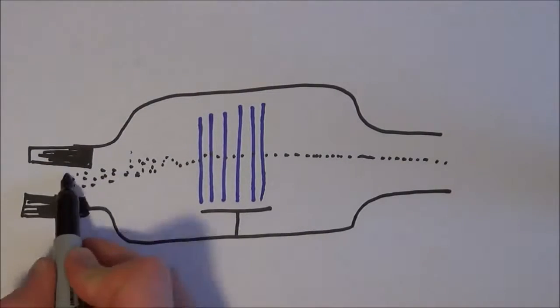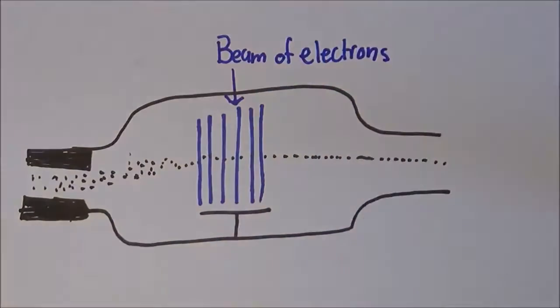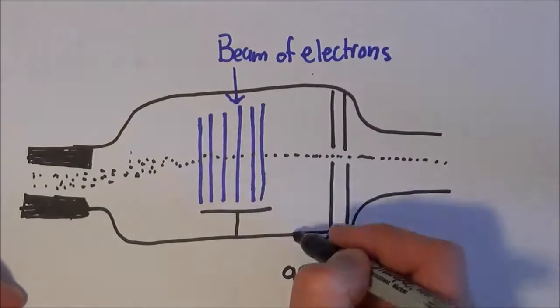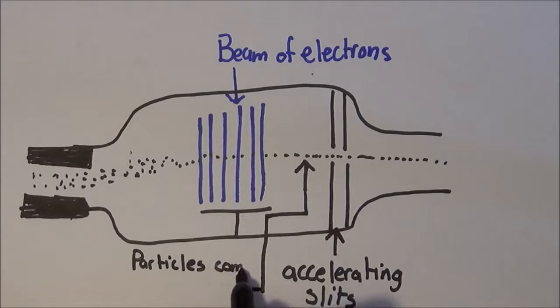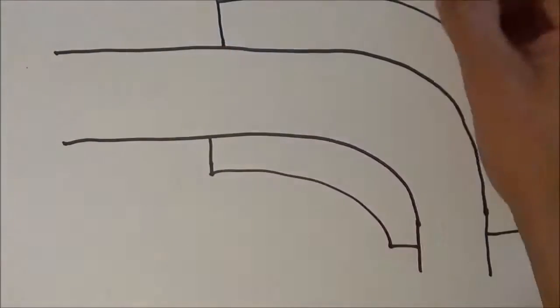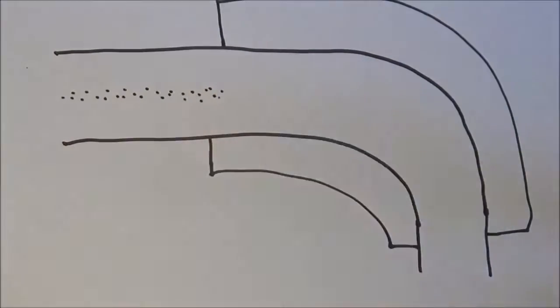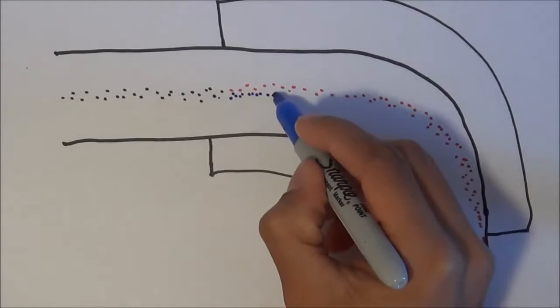As soon as they become positively charged, the positively charged compound repels the highly positive core of the electrostatic accelerator, and all the projectiles shoot out of the small opening. They continue in a straight line and are deflected by the electromagnet. After deflection, the particles hit a sensor. Depending on where each particle hits a sensor, which is a silicon barrier, it is given a mass-to-charge ratio that can then be used to determine each particle's mass.